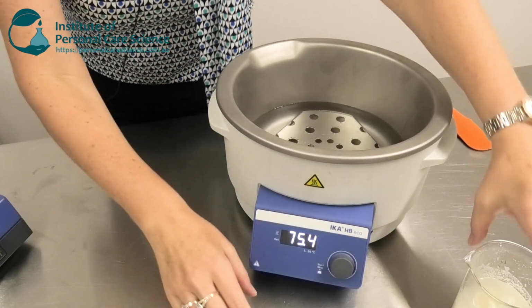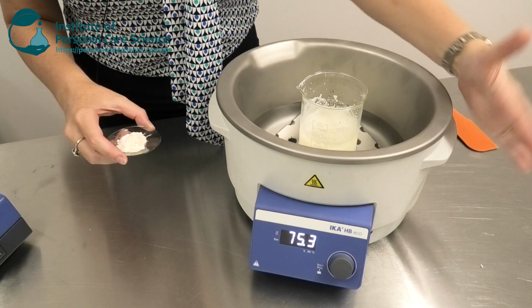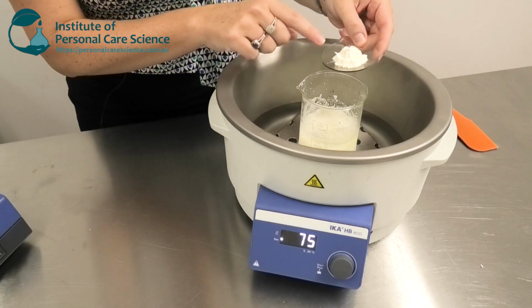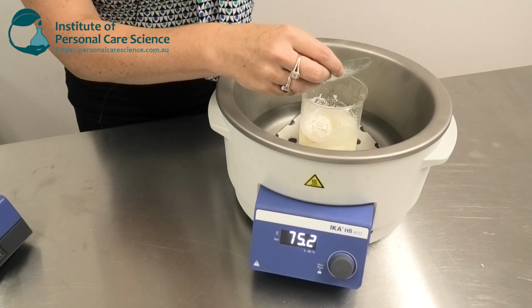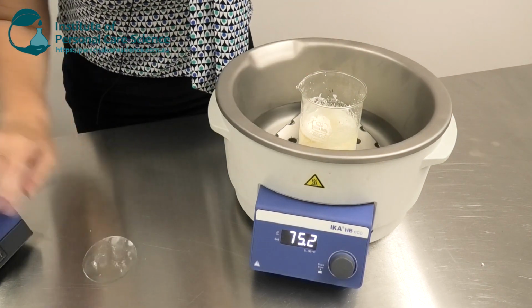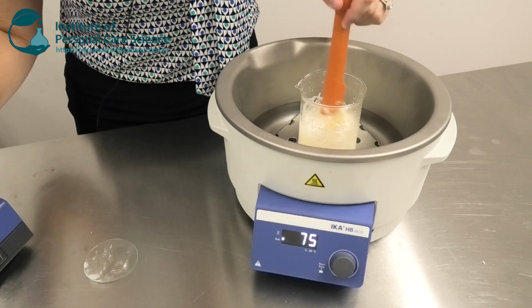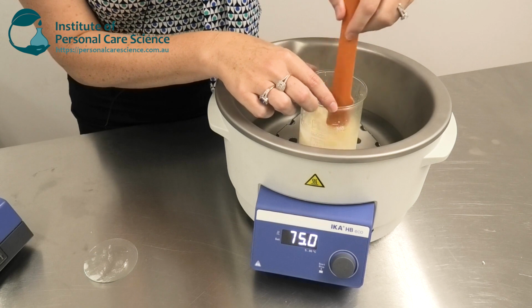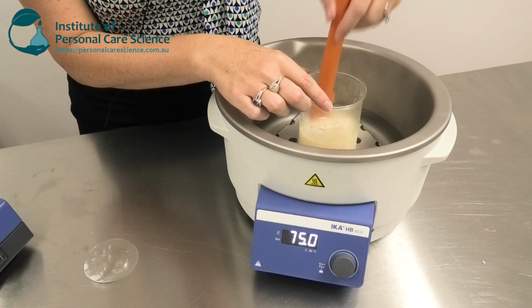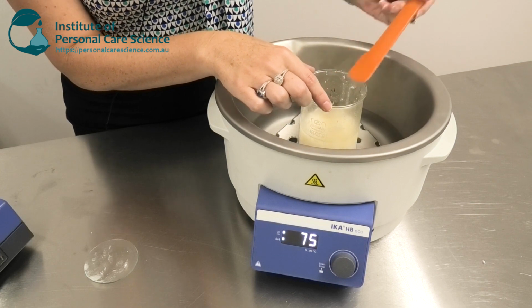Now while that is heating, I'm also going to heat my oil phase in the water bath. And I'm going to add my xanthan gum into the oil phase, so I don't need to worry about gelling it in the water phase, which is heating. I can add this once the water phase is nice and hot. So I'm still slurrying my xanthan, but I'm slurrying it in the oil phase this time. So now I just need to heat both phases to 75 degrees.